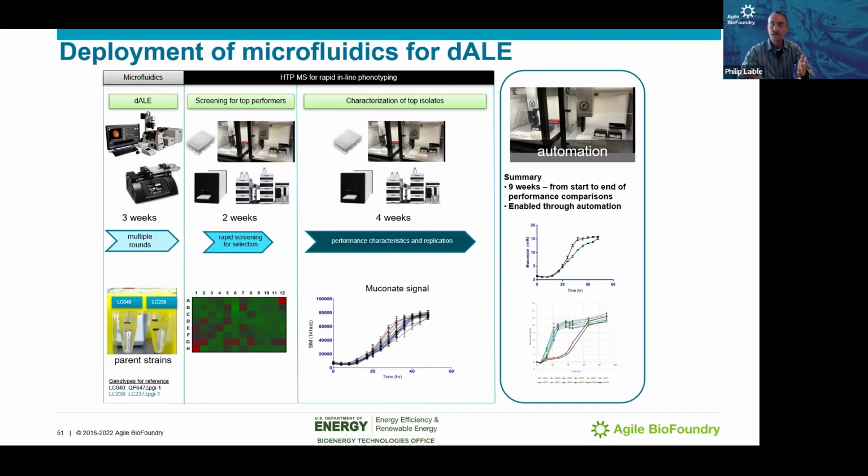And so you further characterize your strains, and we've spent a lot of time recently ensuring that what we're seeing at small scale has relevance to volumes that are important for initial evaluations in bioreactors, heading towards pilot scale evaluations and larger. If what we're doing at small scale has no relevance, then stop. But we'll show you here today how we can get things that are very interesting at small scale that do work out in scale and become of interest.